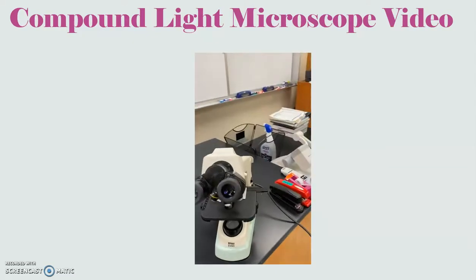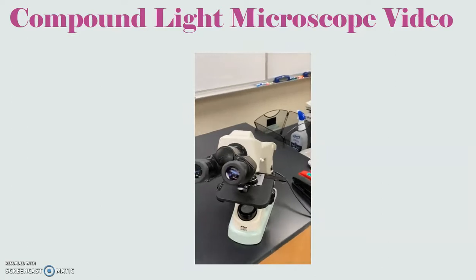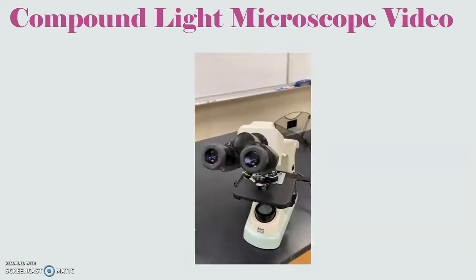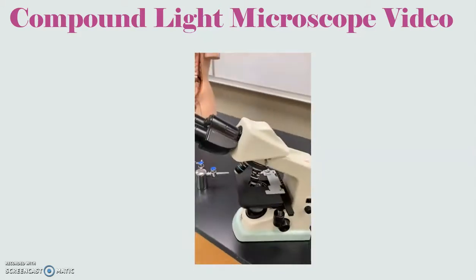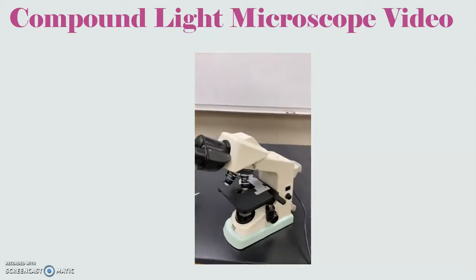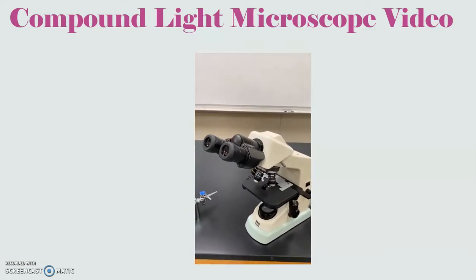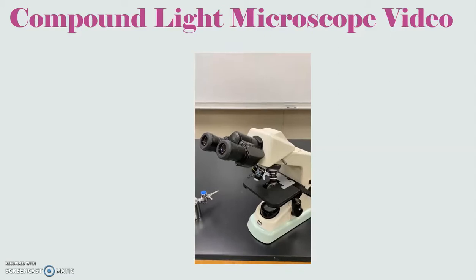Welcome, welcome. This is the microscope that we will be using in lab. In today's video, I am going to walk you through each one of the parts of the microscope. Please refer to your PowerPoint to know the functions of each one of the parts of the microscope.